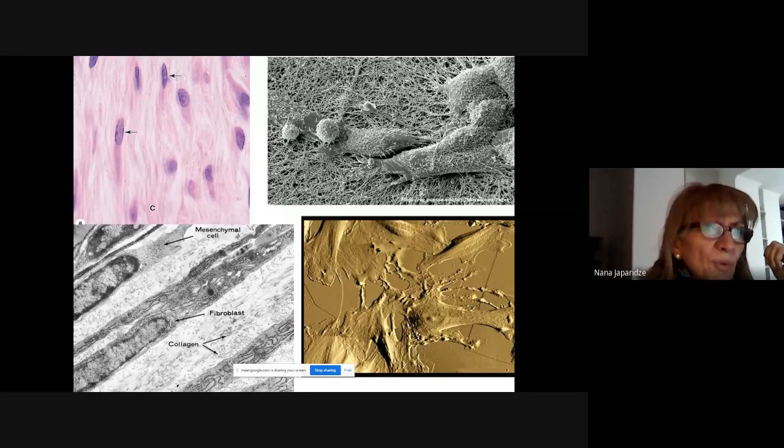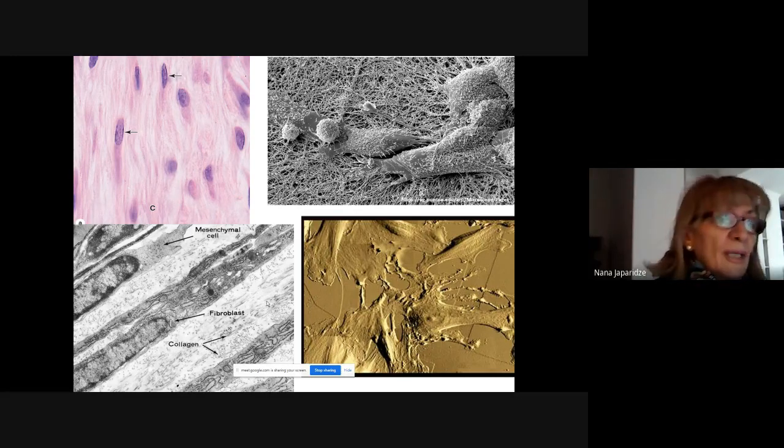I want to show you a scanning electron microscopic image of fibroblasts. Look, these are blood cells, and these are collagen fibers. Look at these pink stained collagen fibers, and these dots and thread-like structures are also collagen fibers, and their shape depends on the plane of section.